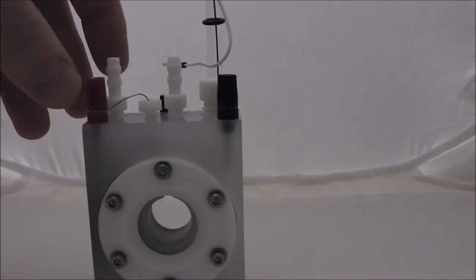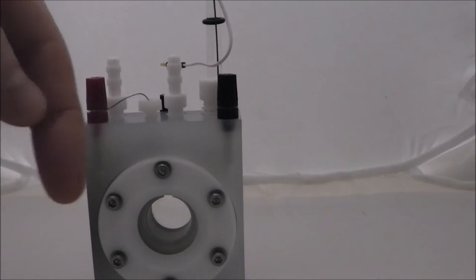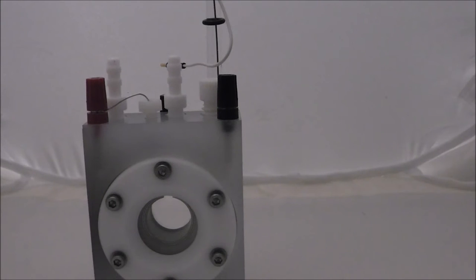You can put your own working electrode in there as well. The PEC2 cell allows light to be transmitted straight through the cell, so you can run emission type experiments, transmission type experiments, and absorption type experiments.